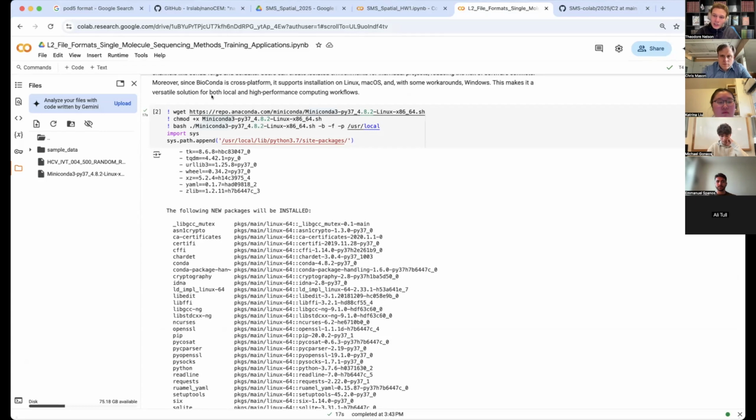How are you going to manage your computer, your software systems, to make sure that when you're using SAMtools, it links to the pandas version that it needs, and when you use program Y, it links to the pandas version that you need? So at a certain point you need two pandas versions, because they require two different versions. They were developed at different times. And you need to containerize it in a way that the program knows on your computer which pandas version to use, and it doesn't mess up.